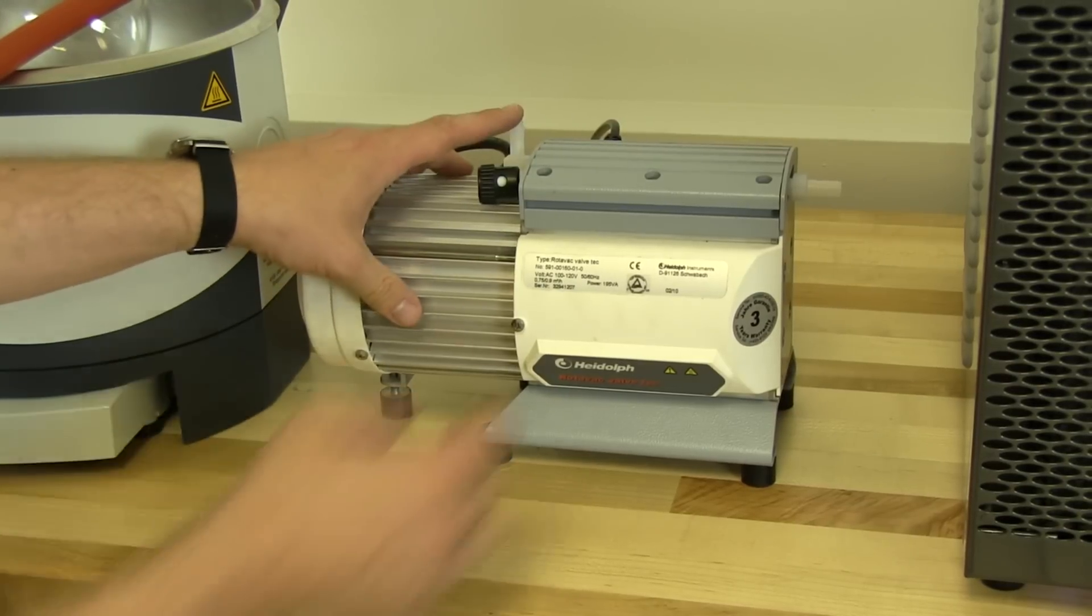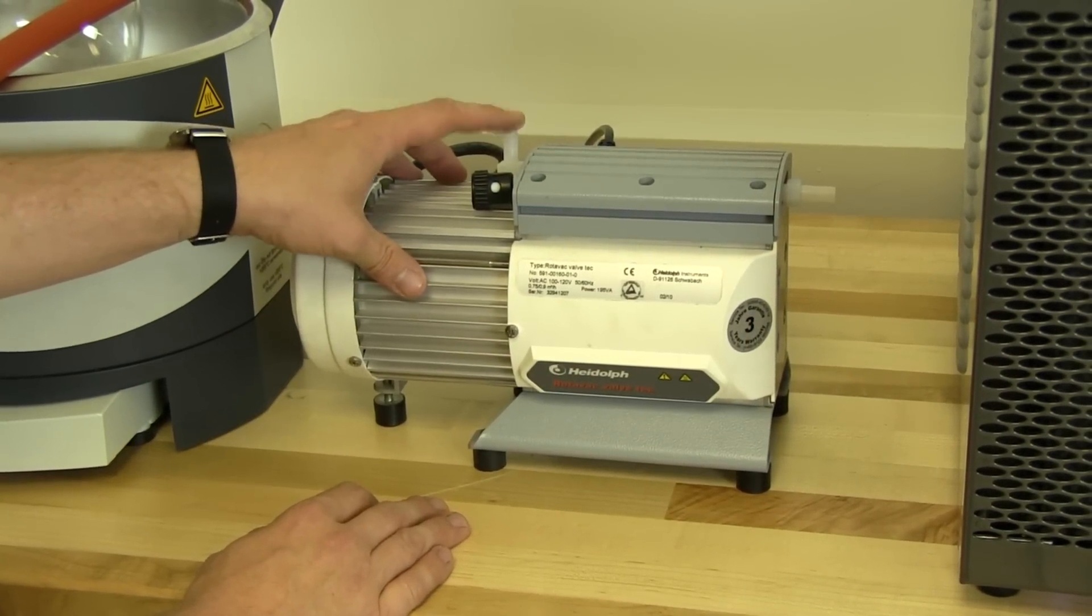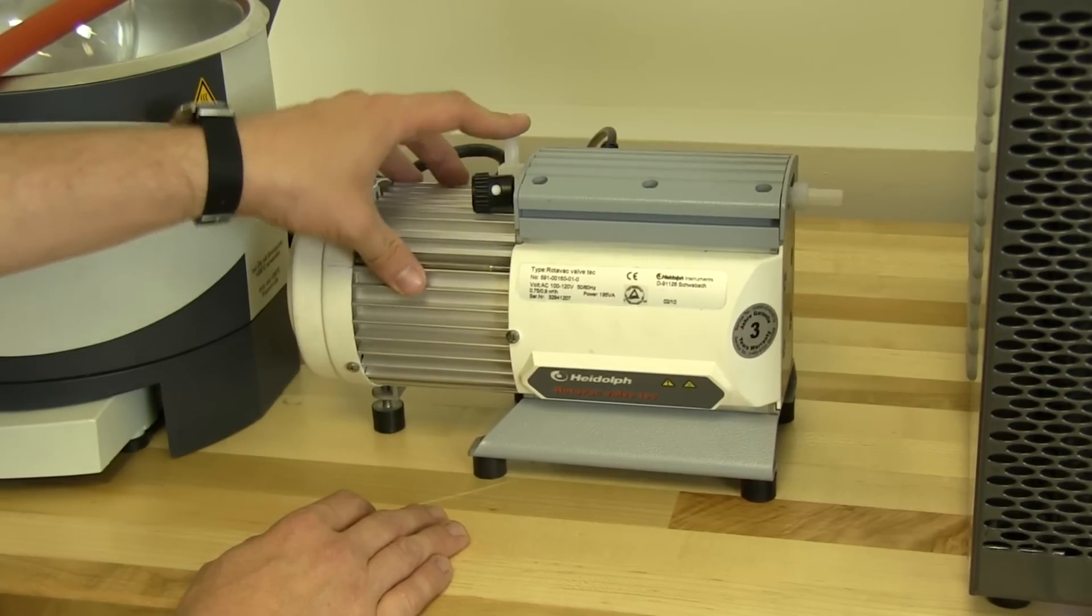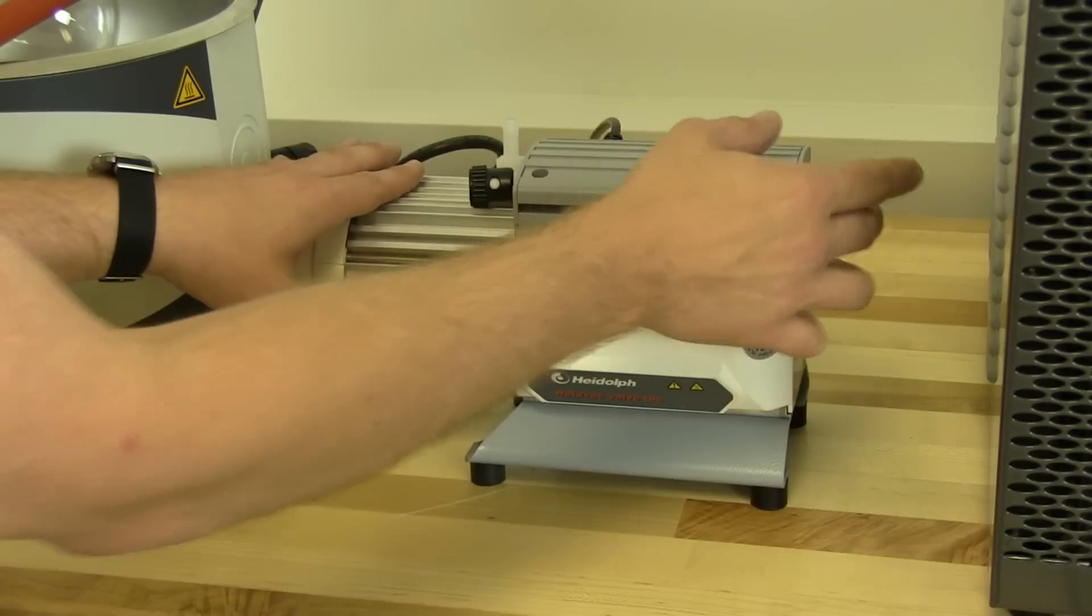So just turn the vacuum pump on if you're not sure, if it's not labeled which one is inlet and outlet. If it pulls your finger in gently, that's the inlet that connects to your glassware, and here's your outlet.